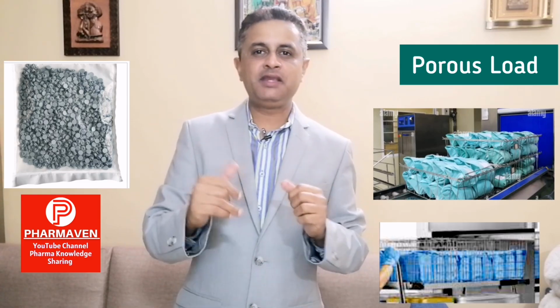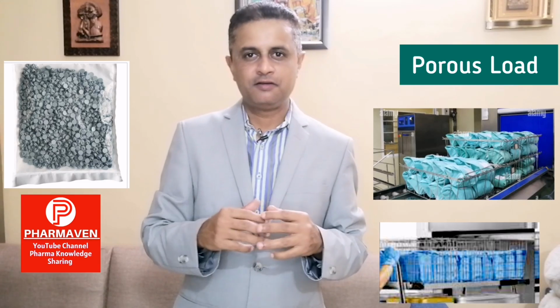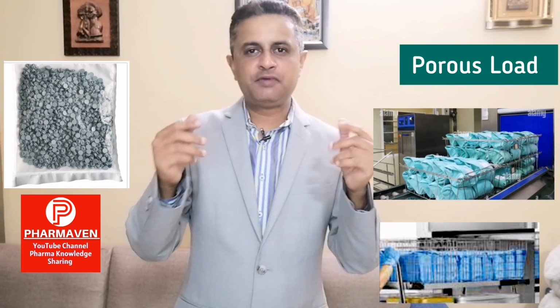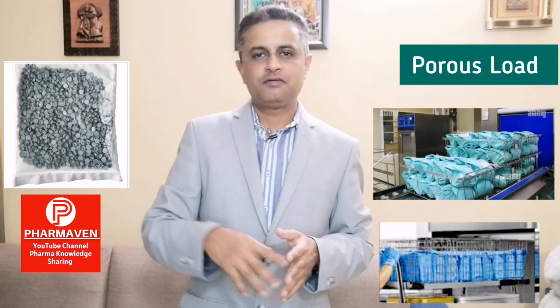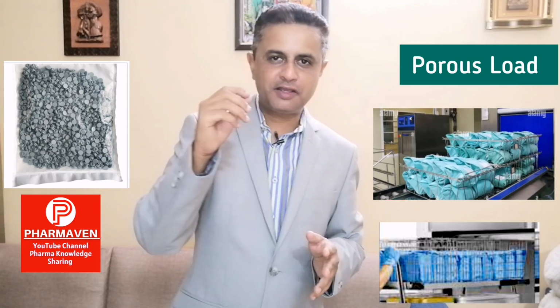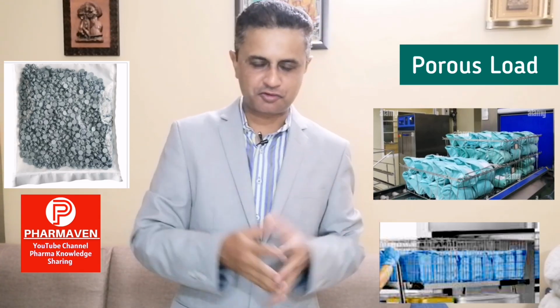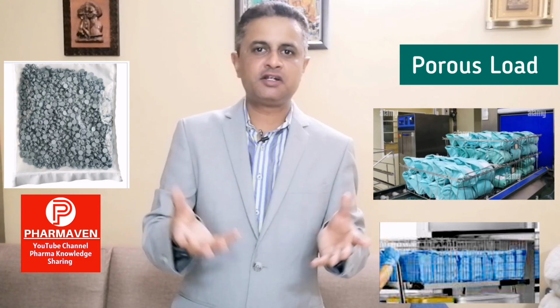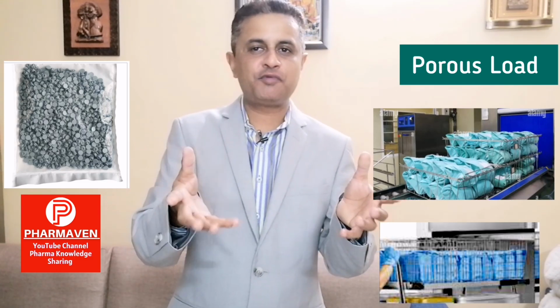It may have different sterilization requirements. Why? If we are putting 50-60 garments inside an autoclave chamber, then for an autoclave cycle, for a vacuum pulse, it will be very difficult to remove the air from the porous load. If we are putting 13 mm stoppers, for example, they sometimes come in 10,000 stoppers per bag.